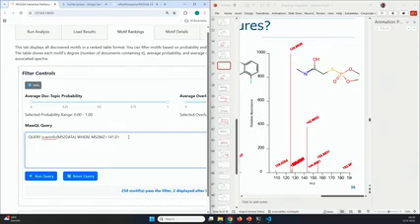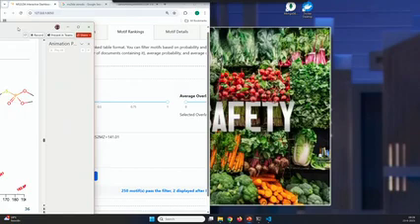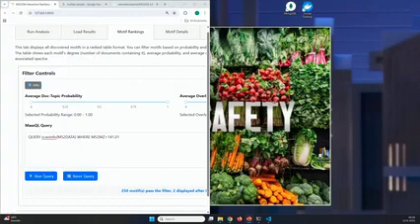And to show how this can work manually, or also with the annotation guidance, I will now go in detail into the motif details plot, or tab actually. So let me go back here. There's a question here. Oh yeah, Nick, go on.